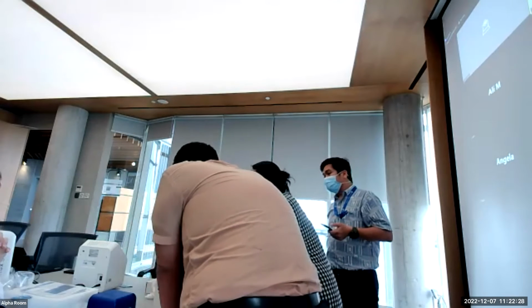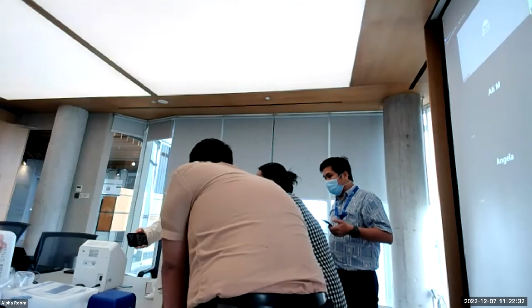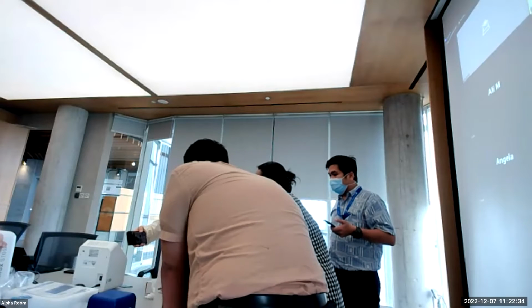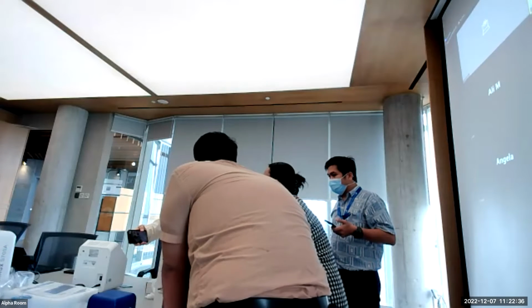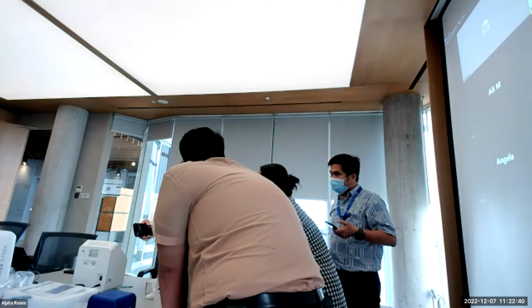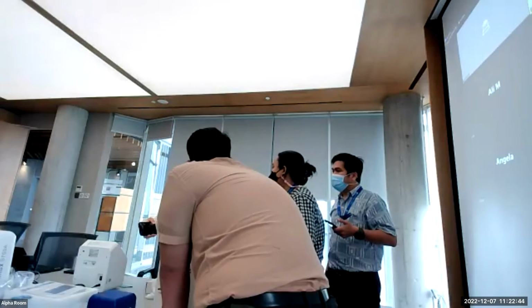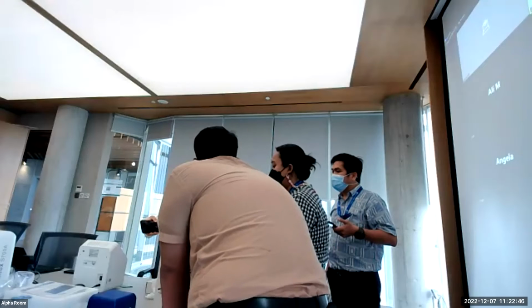What is the maximum weight of the animal that we can use this with, in the small animal anesthesia? What kilogram of animal can I use? The weight of the animal.